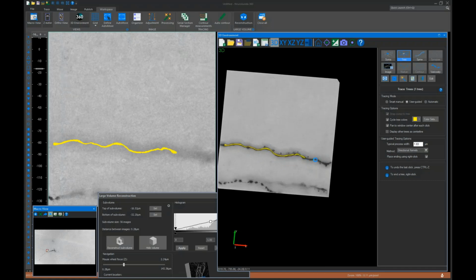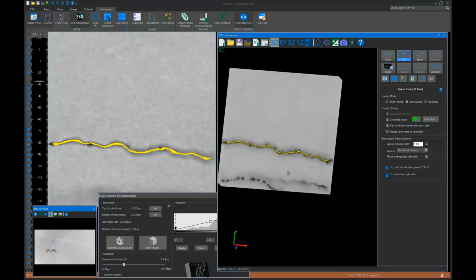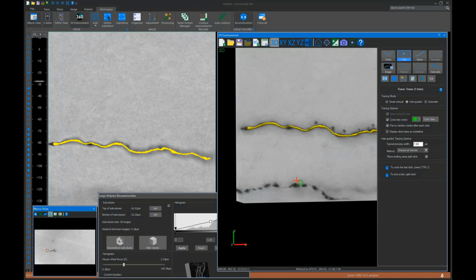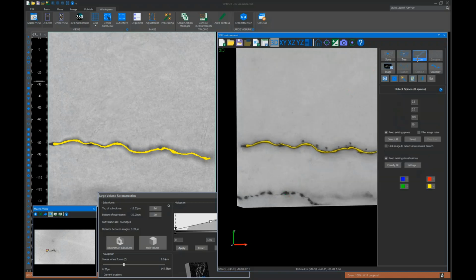tracing, and like Sue had mentioned previously, you want to reconstruct as much as possible to have an accurate reconstruction as well as to get the most out of the mode. And so you would identify the spines, for example. Yep, and since we've worked with this image before, we know the parameters that will work best.